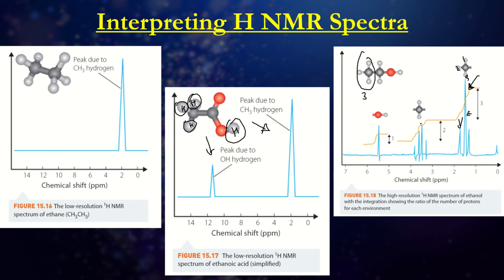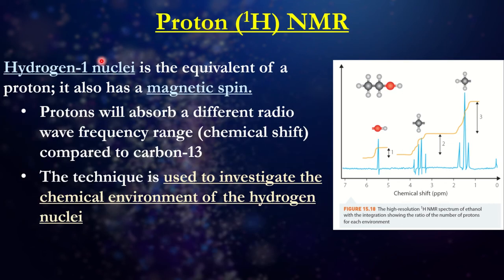We have 2 little peaks here. So that represents this one here. And then we have 1 peak to represent this shift that we have here. Obviously, the peak will tell us in terms of the absorption. So that gives us some really nice information there.